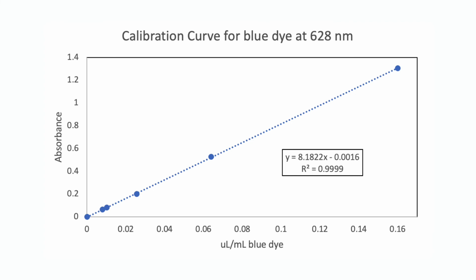With my calibration curve, I can now read the absorbance of unknown samples and use the equation to calculate for their concentration. Convenient, right? I need to emphasize, however, that we can only use this curve for absorbance values included in the curve. If we were to extrapolate concentrations, we might actually be assuming that the curve is still linear at that concentration. As what we saw earlier, the curve starts bending at a high concentration. Always dilute your samples if the absorbance goes beyond the standard solutions.